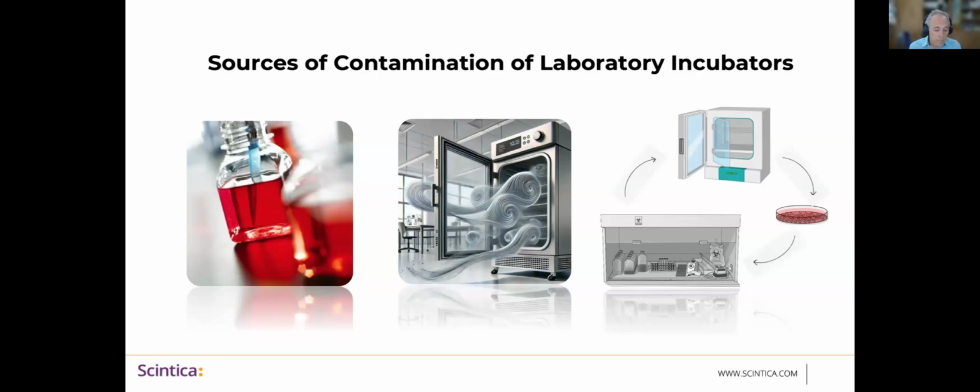So you have to be mindful about the way you set up and store items in your biosafety cabinet, as well as on your lab bench and in your incubator, that can create a nightmare cycle of reintroducing contamination if one of those components isn't taken care of properly.